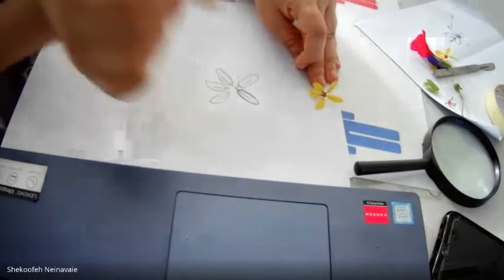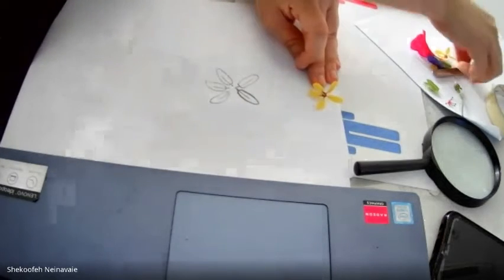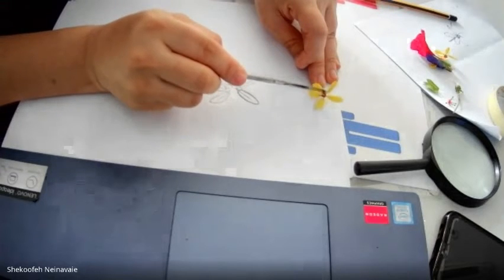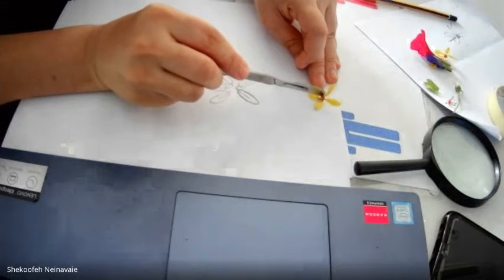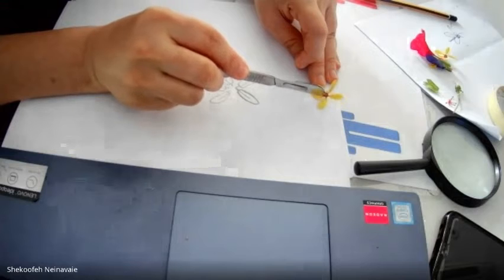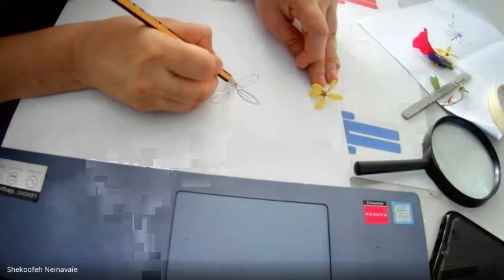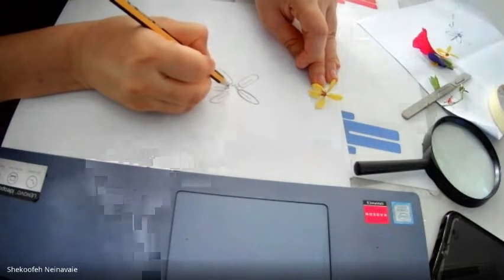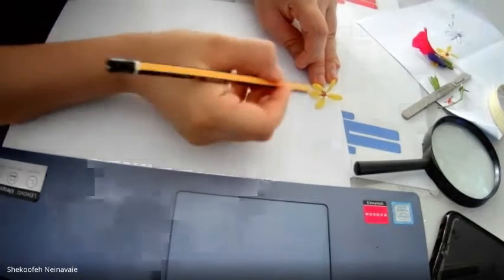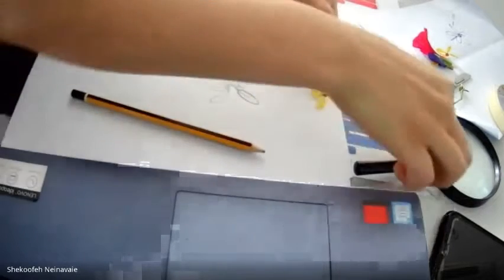Okay, so now the inside is also very important. What I see, these are the sepals, but I want to pull them a little bit apart, away from the female and the male part of it, but I don't want to damage it, so we can see the inside too. So these are the small sepals here, here, here. I don't see the other side, so I don't draw them. And these are how many? 1, 2, 3. Let's see how many males it has.